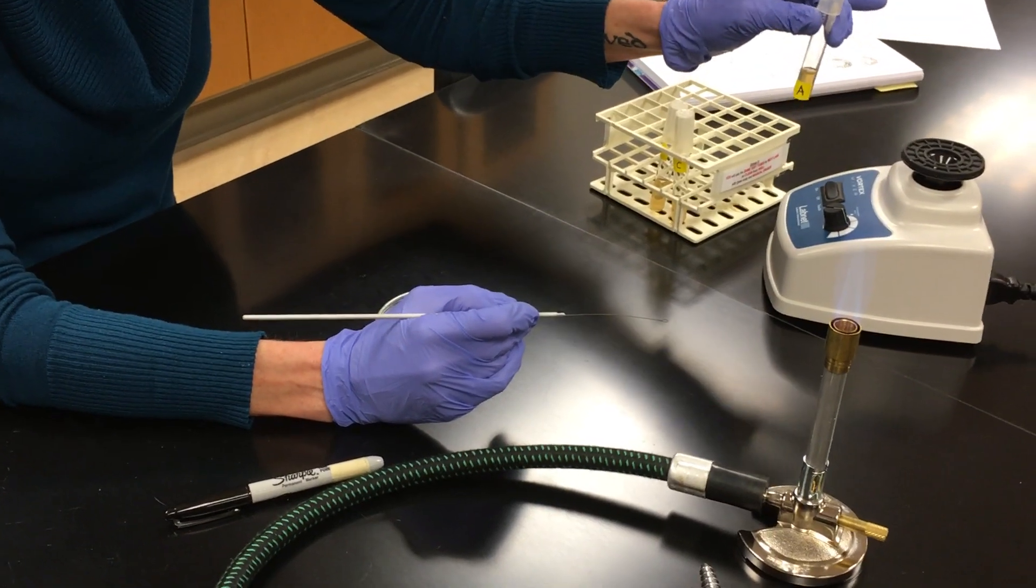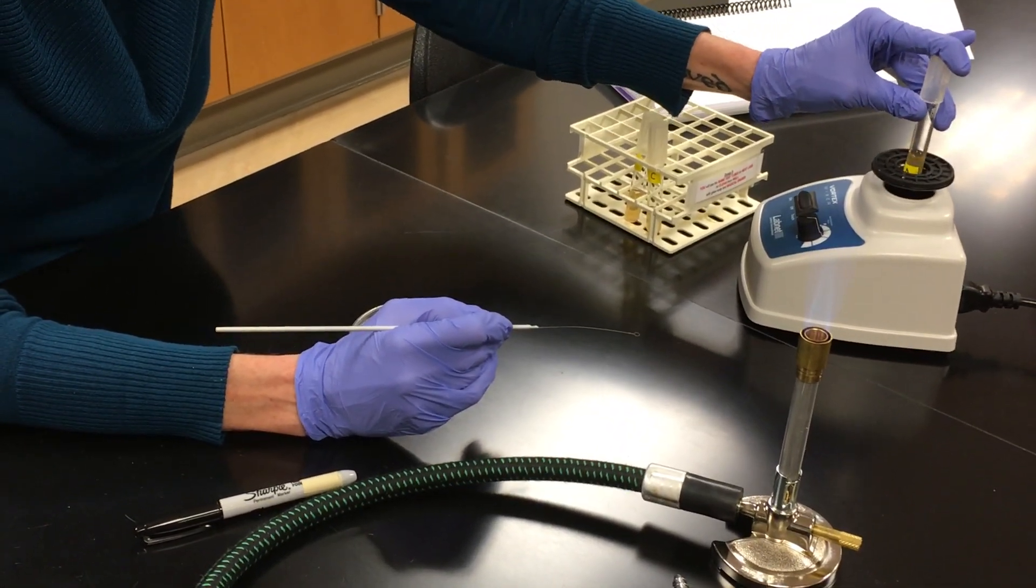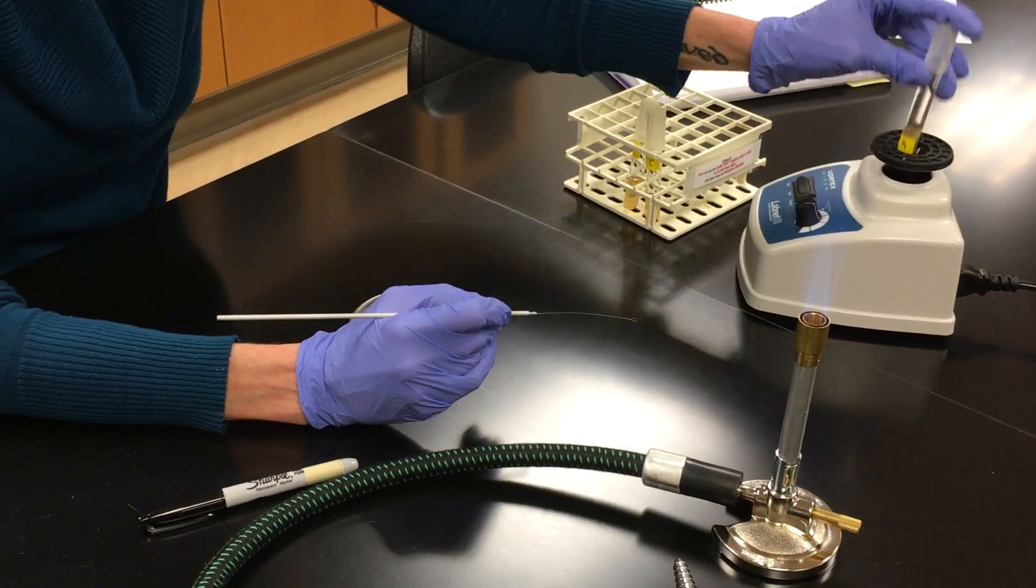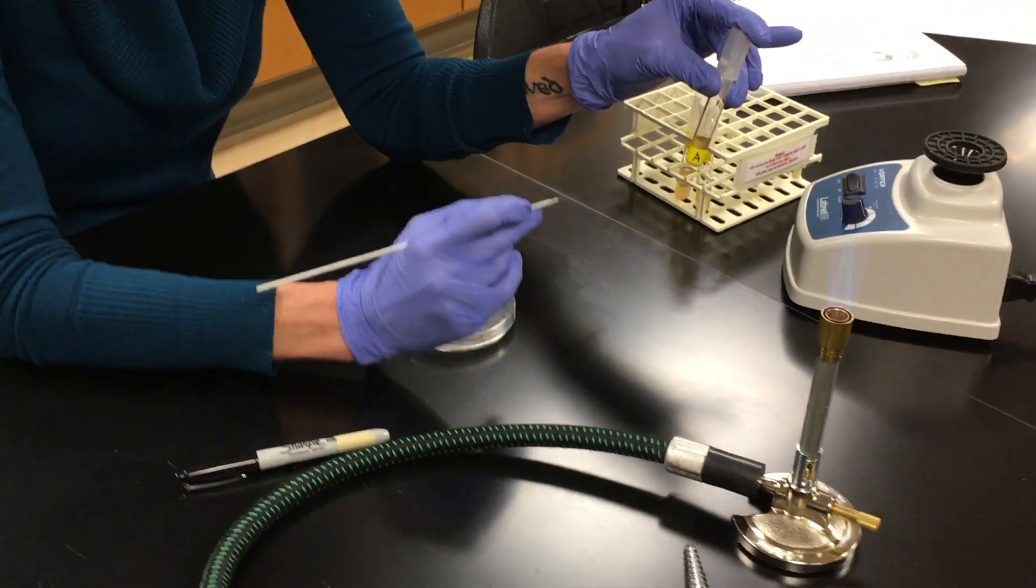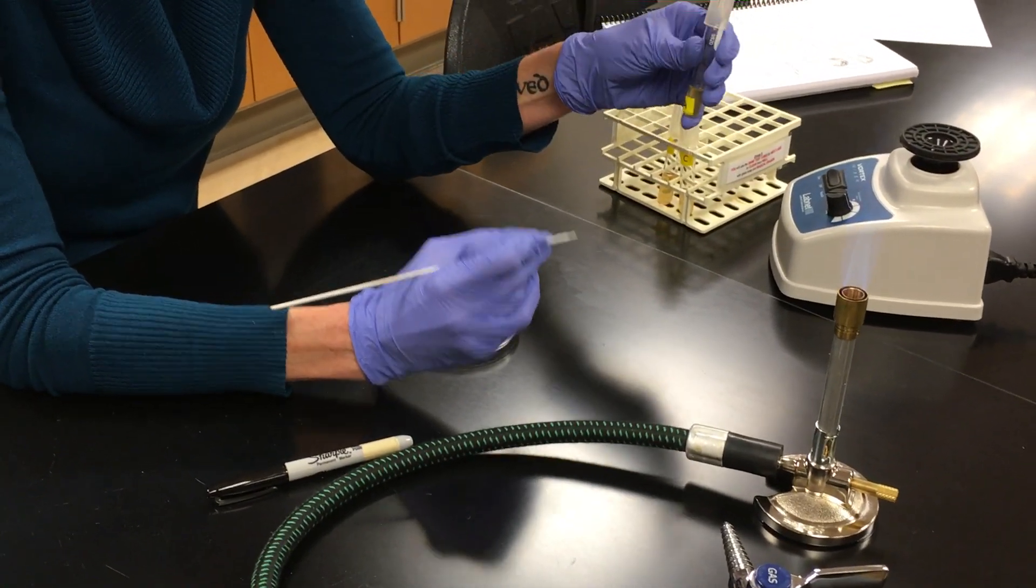You're going to hold the tube in the middle, put your finger on the cap, and all you need to do is push. And all we're doing is we are mixing up the culture to evenly disperse the two different bacteria in that culture tube. So we have a mixed culture tube.